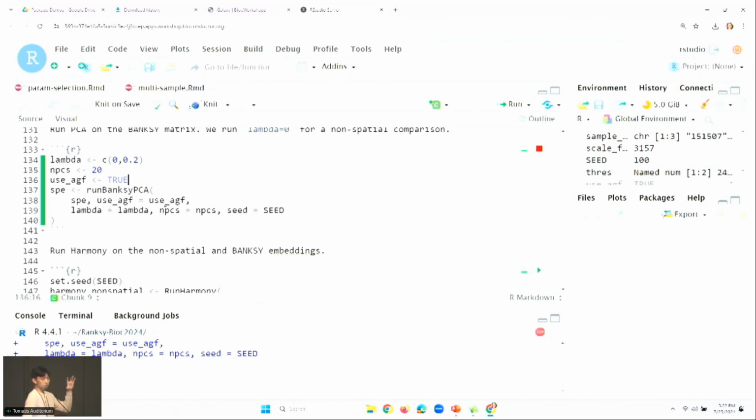So as the feature set size grows, say you double it, the computation doubles too. We're thinking of strategies to make it more efficient as the data sets grow larger, especially in terms of the number of features. So if you have any feedback or ideas, we'd be happy to take them as well.